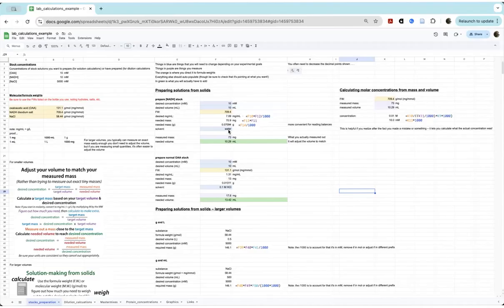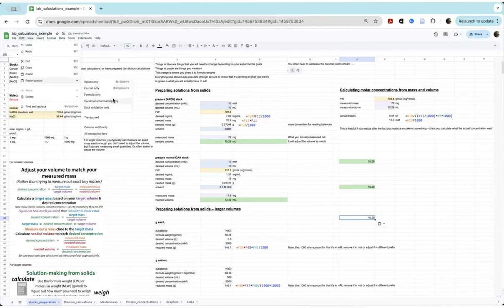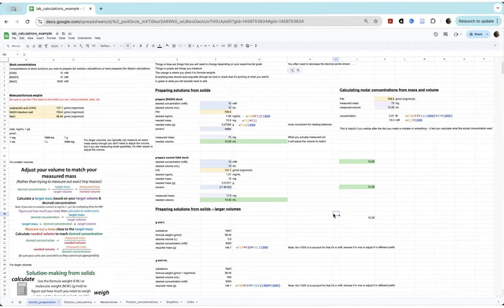Note too that once you calculate a value, if you paste it in another cell, you're going to get errors. You want to instead do Command Shift V if all you want to paste is the value. Here you can see it didn't even paste the format of the background. If I want to copy the format of the background, I can come over here and use the little paint format, and it'll format this. It'll also copy it if the text font or the size or bold changed. But again, Command Shift V if you just want the values. You can also go to Edit, Paste Special and see some of the options there, but Command Shift V will just do the values.